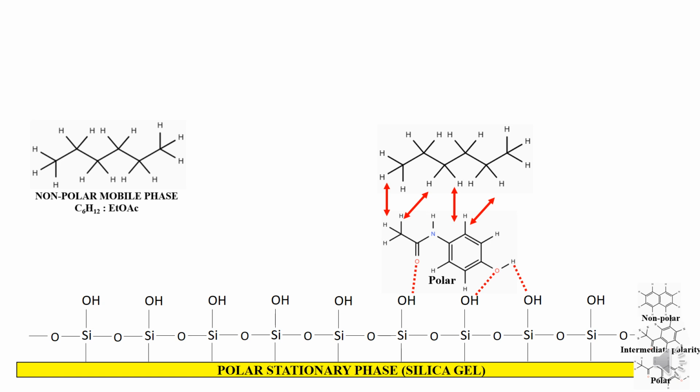And it also interacts with the non-polar mobile phase containing hexane and ethyl acetate, and it interacts by van der Waals attraction. So the non-polar groups of the paracetamol molecule like the benzene ring and the methyl group interact with the non-polar mobile phase via van der Waals attraction.